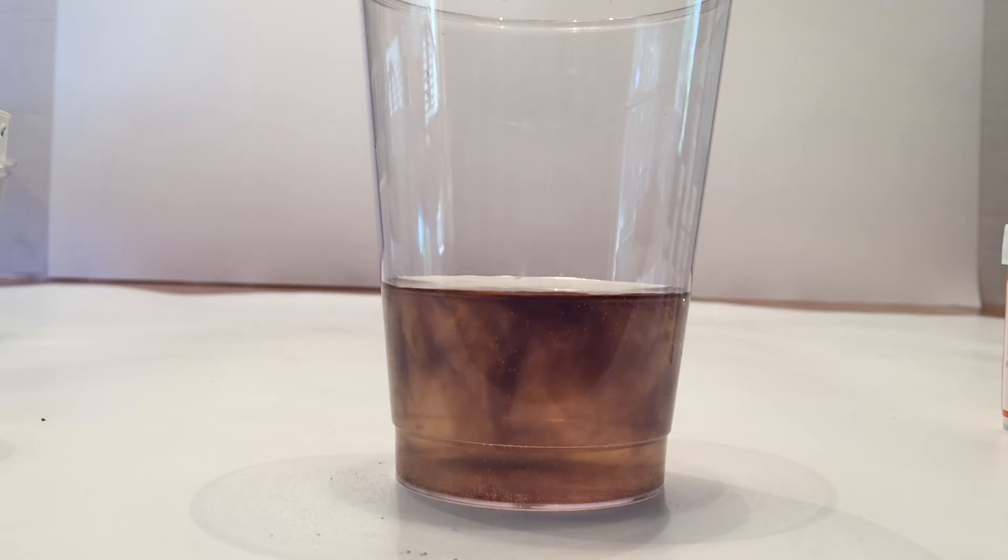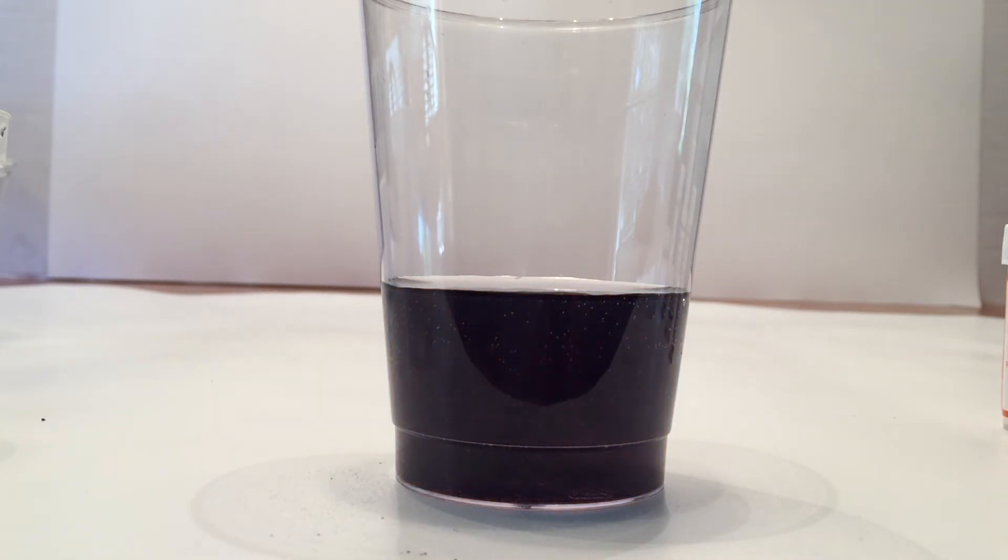In this one of a kind chemistry kit, you can make a clear solution and watch it change to yellow, to blue, purple, black, and then back to colorless. It's amazing to watch the colors repeat the color cycle again and again.